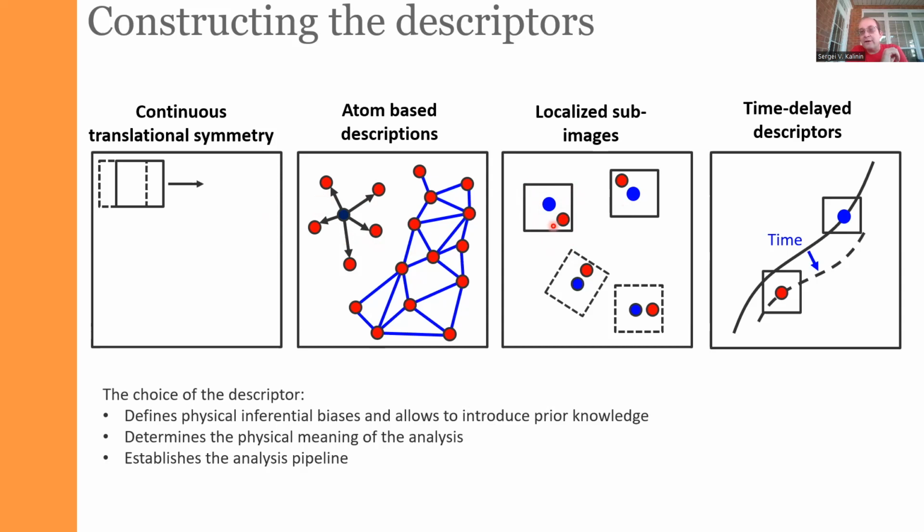The interesting thing here, which was actually a very big showstopper that took us about a year to sort out, is that microscopy images come with very interesting properties. Very often you really don't know what orientation an individual unit will have in the image plane.